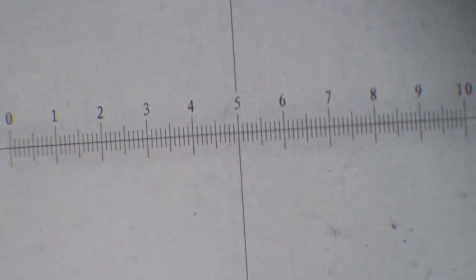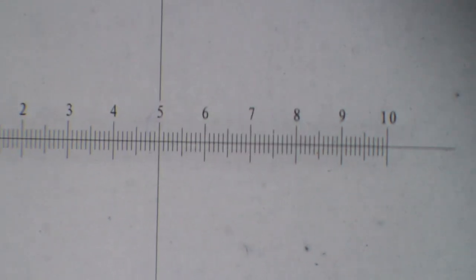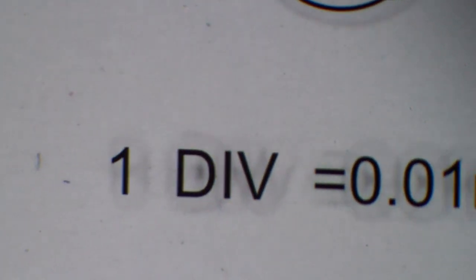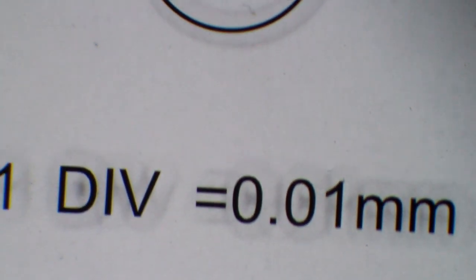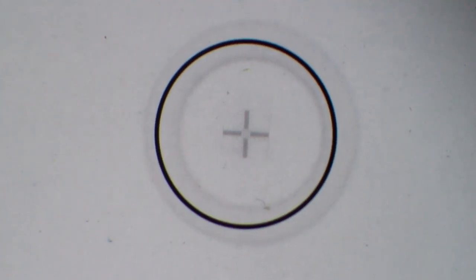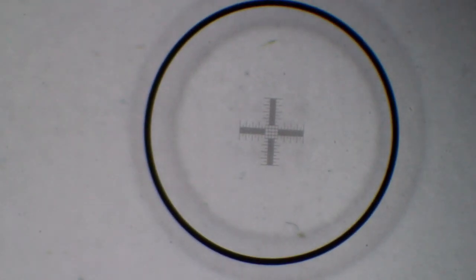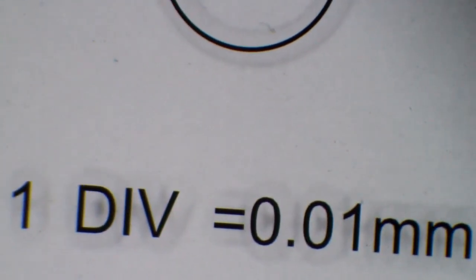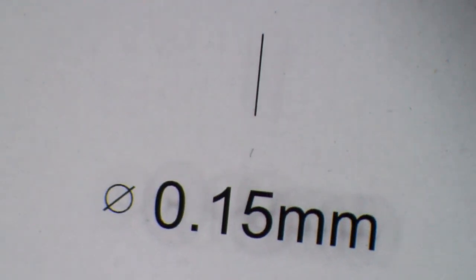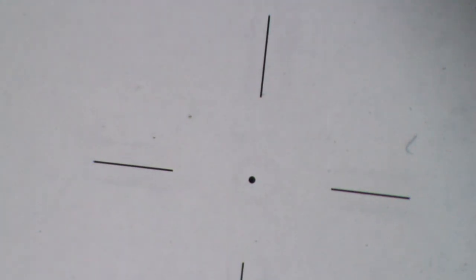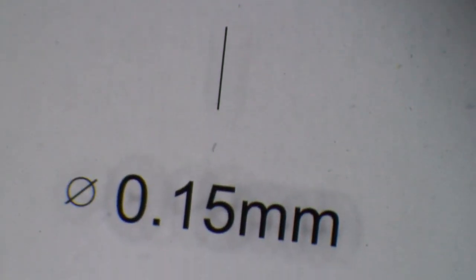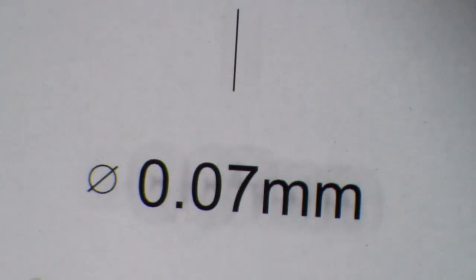This is now using 40 times magnification under my stereomicroscope. Here, that's the next larger one, a hundredth of a millimeter. And it's already quite small here, and I'm zooming in a little bit more and have to refocus now. You can barely see the lines right now. And then I'm zooming out again a little bit, and now let's have a look at the two dots of 0.15 mm. There are basically some crosshairs, so it's easier for you to find the dot. But as I mentioned, please mention in the comments if you know what they are used for, what they are actually used for calibrating.